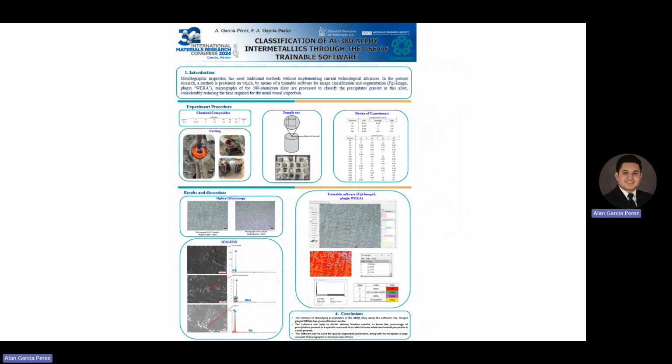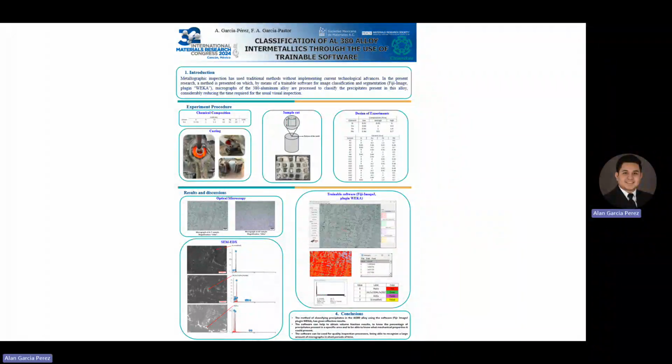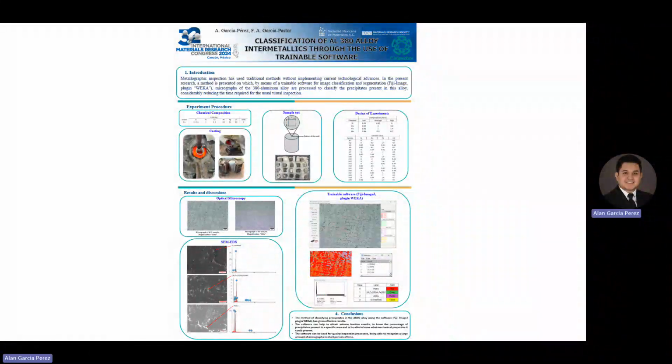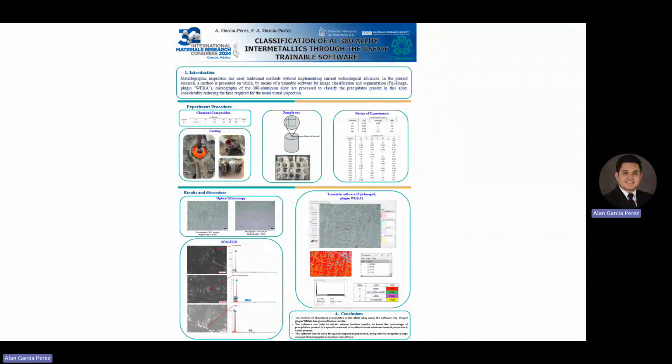And when comparing them with the literature, it can be concluded that the precipitates indicated in the micrograph of the SEM, EDX correspond to their level. The segmenter can take advantage of the type of coloration of each precipitate to identify it with its corresponding level.